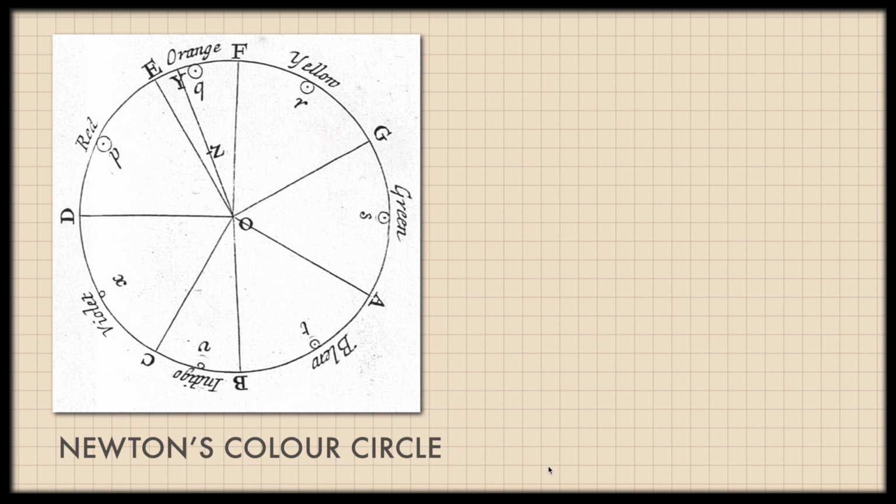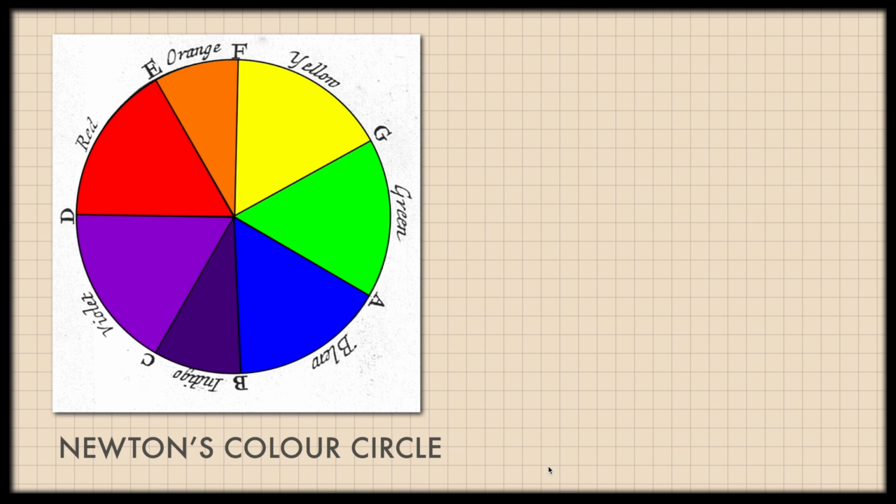So let me just superimpose a different color circle, I have just made some changes. This is the original Newton's color circle. So let me just superimpose that. Now here we can clearly see, if suppose a molecule absorbed somewhere in the blue region, you will get the color in here. So for example, lycopene absorbed somewhere in all these regions, so it is red in color, and then beta carotene is absorbing somewhere in this region, so you get this orange color, and then the lutein absorbs somewhere here. So there is a difference in absorption.